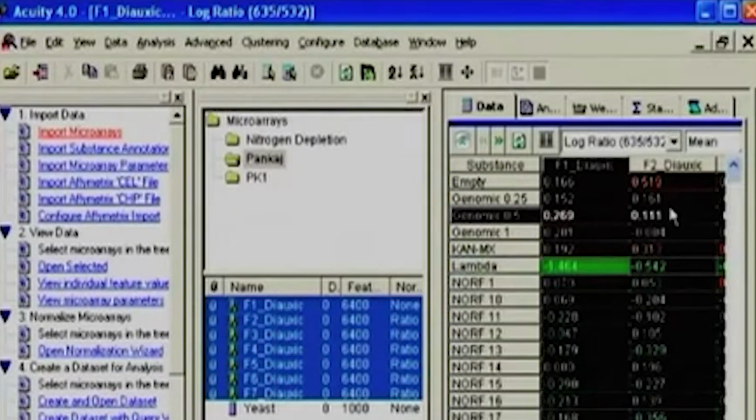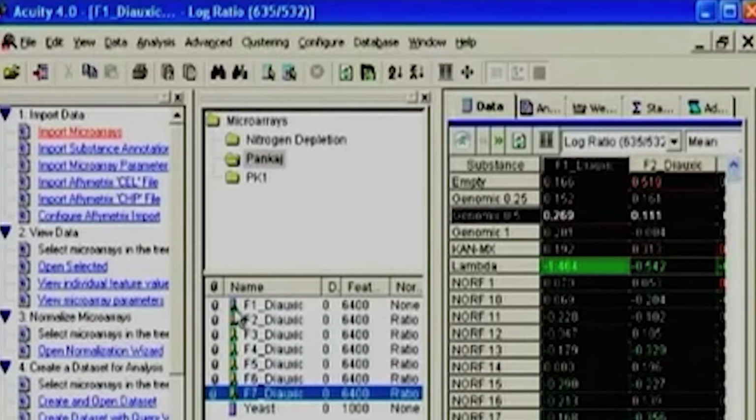Before going into this, let me explain an important factor here. What does each image mean? Sure. Actually, if you carefully look, it may not be very clear, but this is a little purplish in color and the other down ones are a little reddish in color. The purple one means that the data is not normalized. The red color means that the data is normalized, and the little green dot you are seeing tells me that I have a JPEG image which I can see down here. So it allows me a connectivity of what is happening just by visualization.